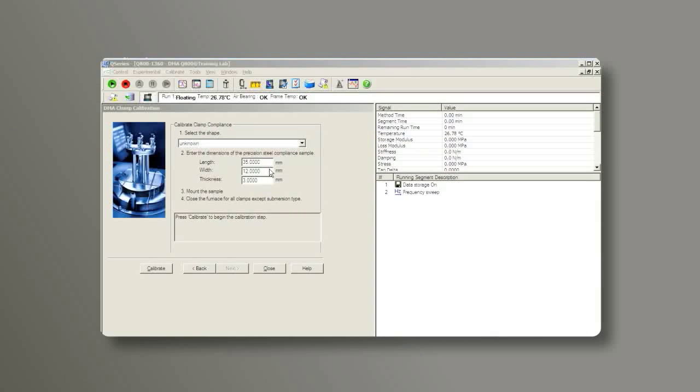Enter the dimension of the steel bar to the software. Please remember, the length of the steel bar is the length of the clamp. Then, click on Calibrate.